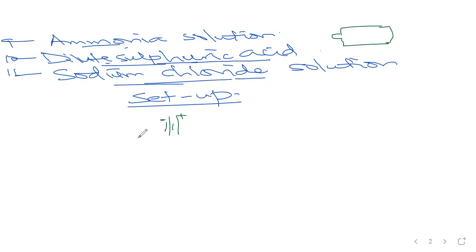All right, in case you don't know how to tell which one is positive, batteries usually have signs to show the positive and negative. Usually they put positive here, and on this side they put negative. This side, where there is this raised thing, is the positive side, and this is the negative side. So you connect your batteries, 6 of them.